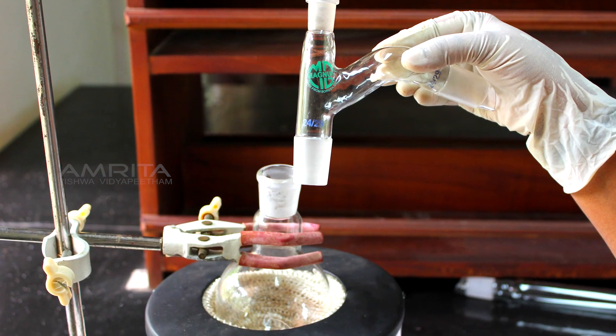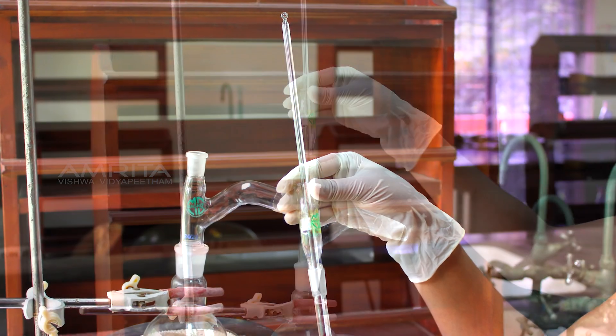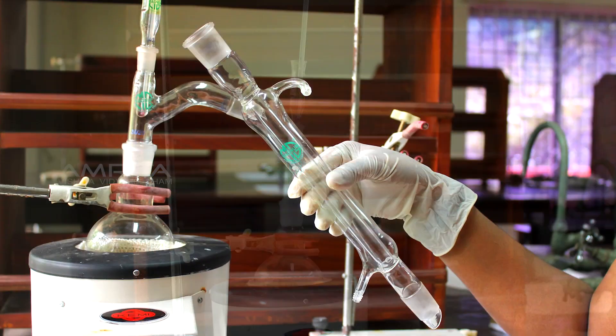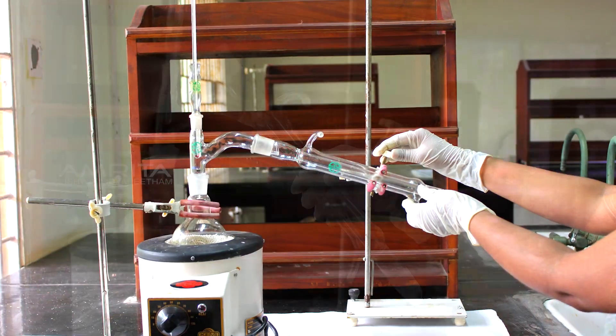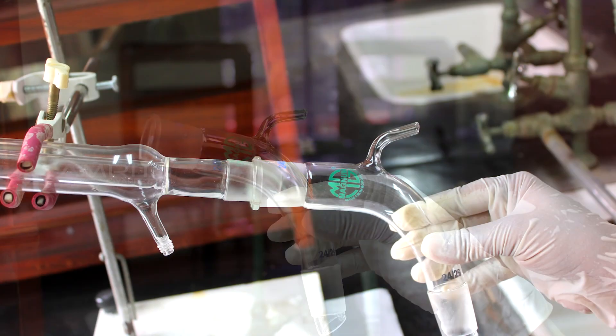Connect a distilling head to the RB flask and a thermometer adapter with thermometer to the distilling head. Connect a water condenser to the outlet of the distilling head and a vacuum adapter to the water condenser.